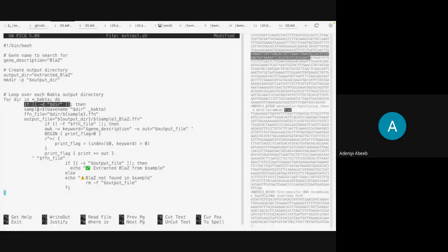It's a different manner of writing out the script. Let's see what this produces, and then we can try that other method. Yeah, I get what Abib is saying.